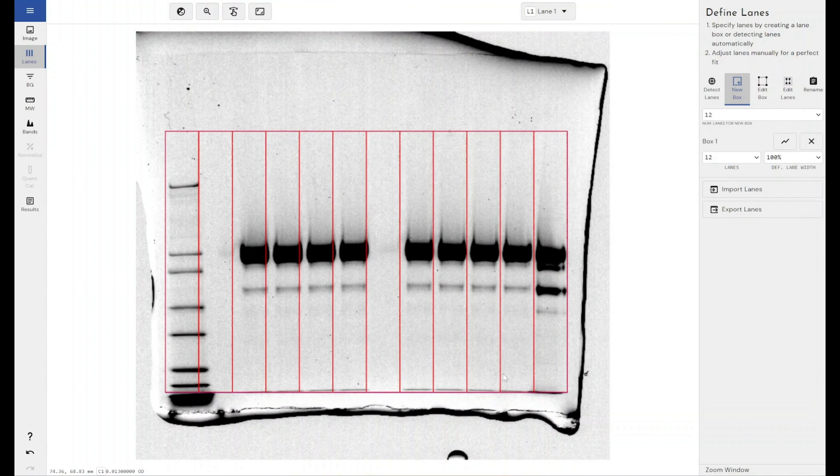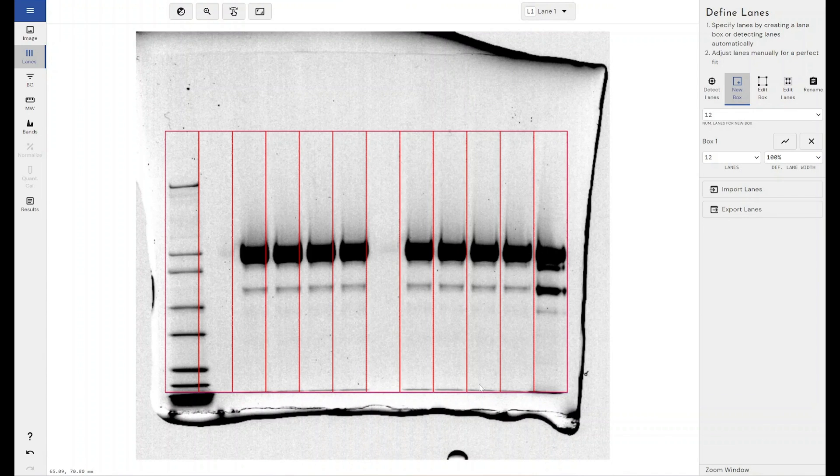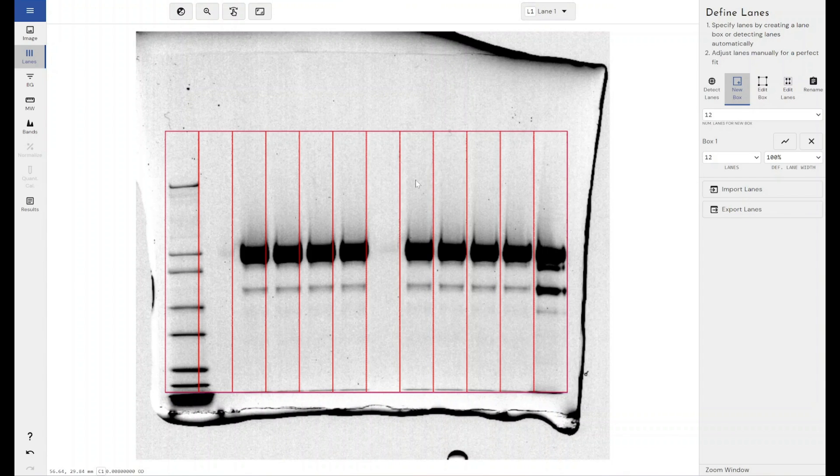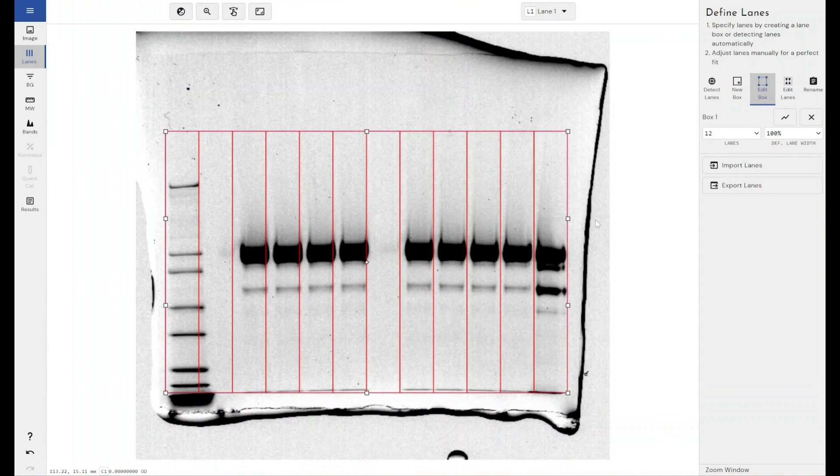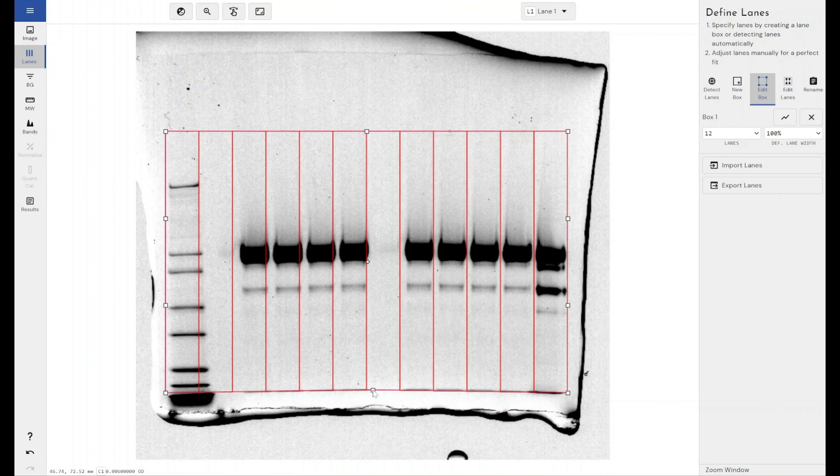If you're in the situation whereby your gel has gone slightly frowny, which has happened with this gel and it doesn't fit accurately within a square box, if you click the subdivide button here you get additional handles with which to warp your lane box to match the attributes of your gel.